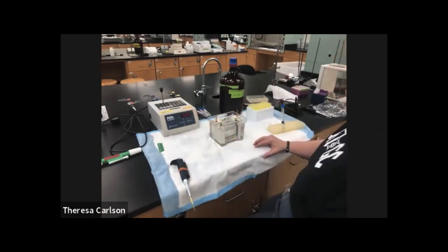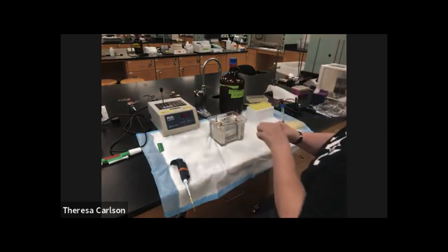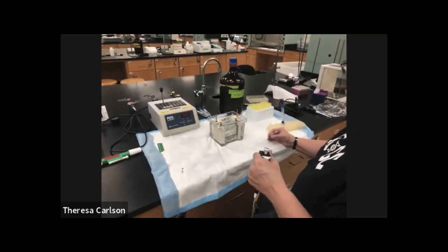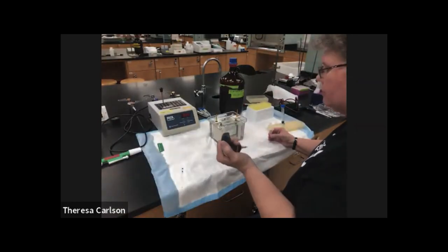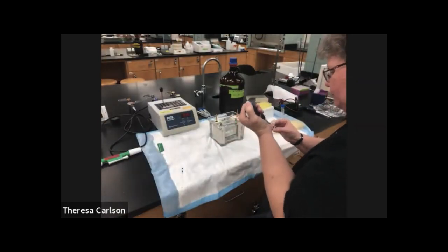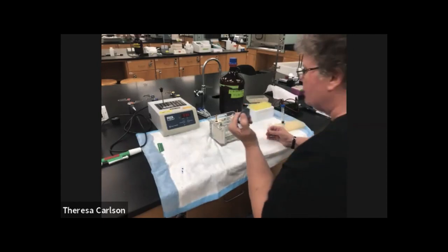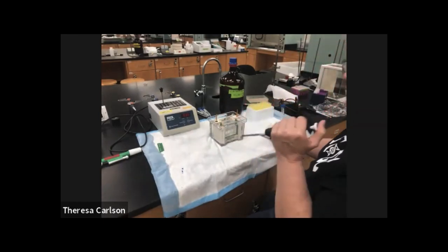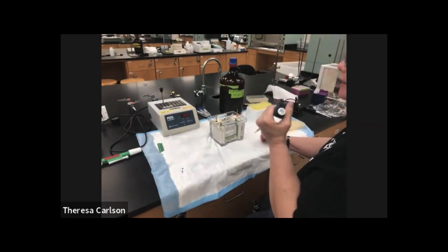Okay, so now our samples have been in the heat block for 5 minutes, and we're ready to take our samples out and start loading our lanes. Our S1 and our S2 are much higher concentration than our S3 and our S4, so we need to load less in each of those lanes. We're going to be loading them in the order S1, S2, S3, S4, marker, and then again, S1, S2, S3, S4, marker in the same gel.